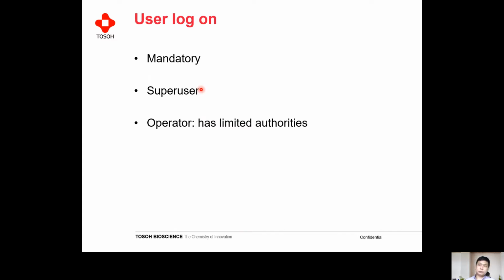Super users are able to have a lot of levels that they can do. They can edit a lot, the expiry, or they can delete samples, they can amend or change the update log information. So operator will have limited authorities.